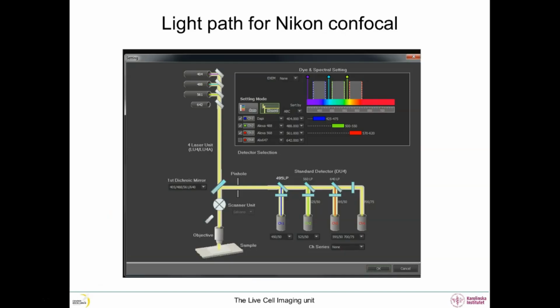Back to our example. The three lasers we have chosen are now on simultaneously, so the three fluorophores start emitting light at the same time. The dichroic mirror sends this complex emission light towards the detectors. The emission light then reaches secondary dichroic mirrors. These are long-pass filters that work exactly as the dichroic mirrors found in filter cubes. The emission light is split in two parts in front of the detector.